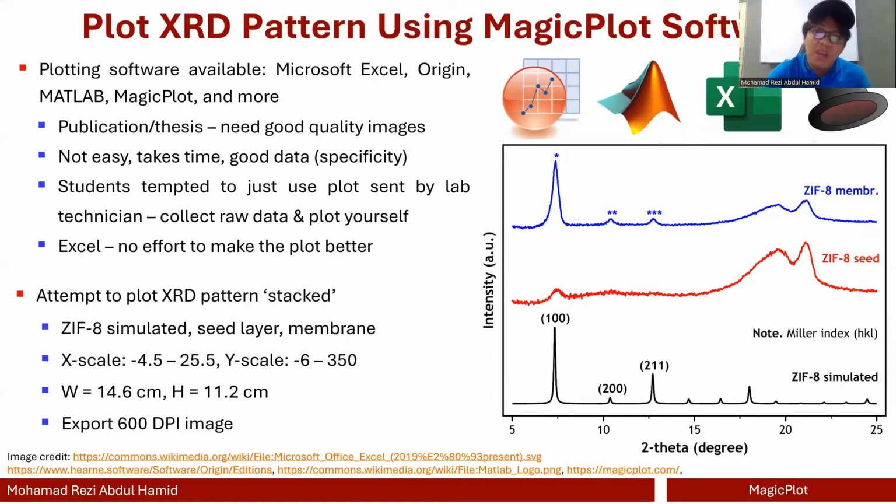Therefore, I recommend you get the raw data from the operator. When students get the plot from the operator, they are tempted to use just that, and the result is a not really nice looking plot, if you know what I mean.